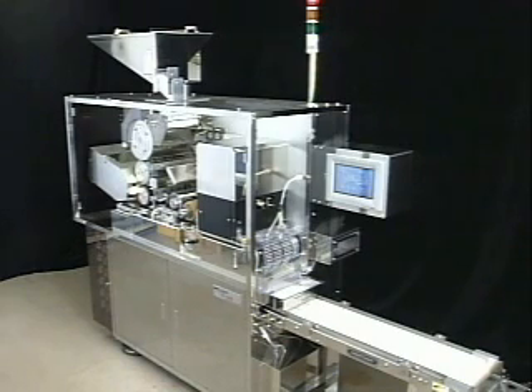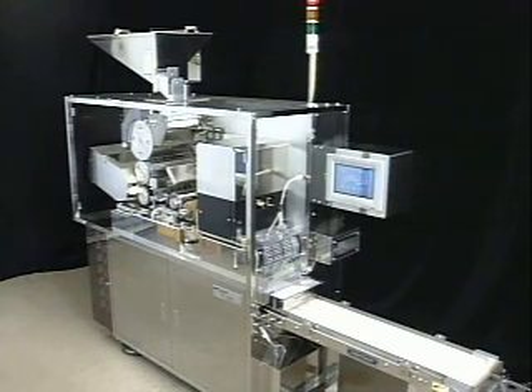After printing, inspection of the printing and the tablet's surface is done at the same time. Accurate checking is performed even in a position where the printing direction is well lined up. Additionally, there is an automatic adjuster for the halogen light that plays an important role in inspection.